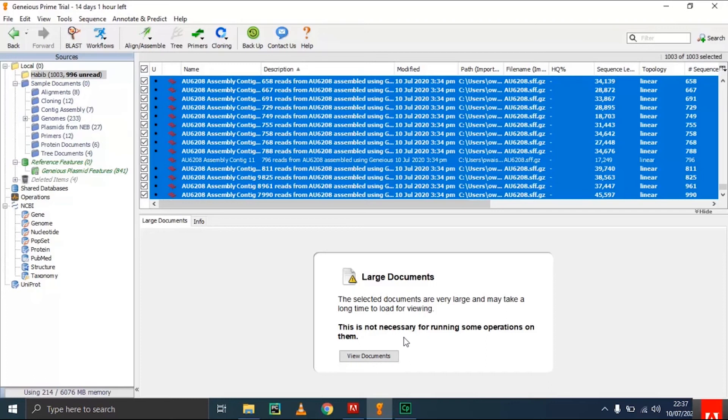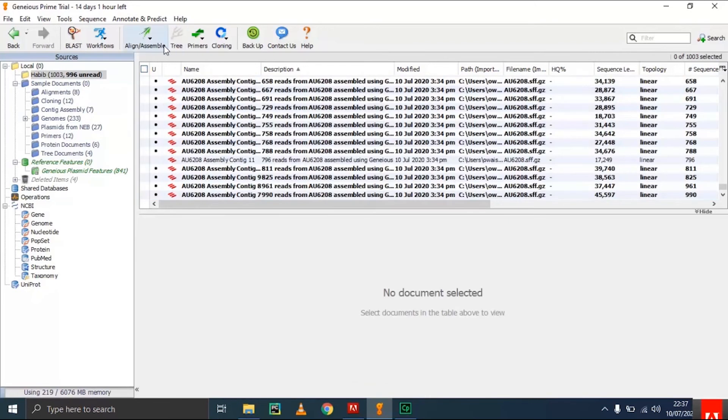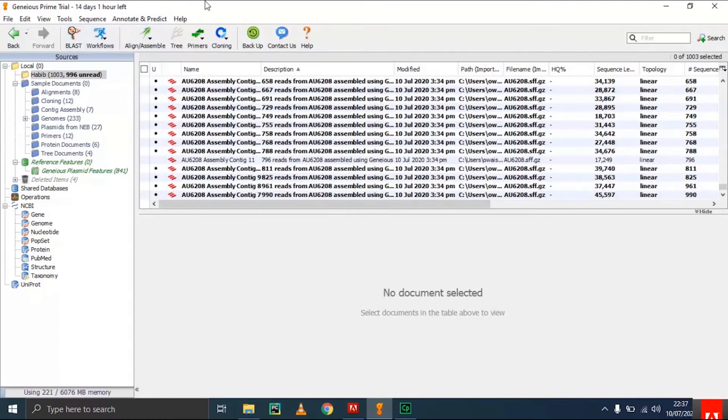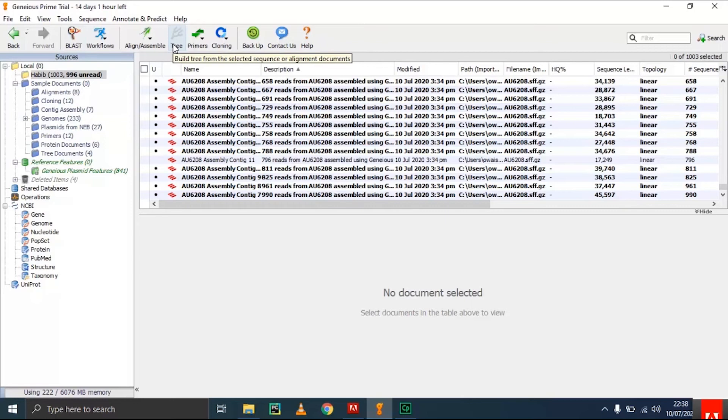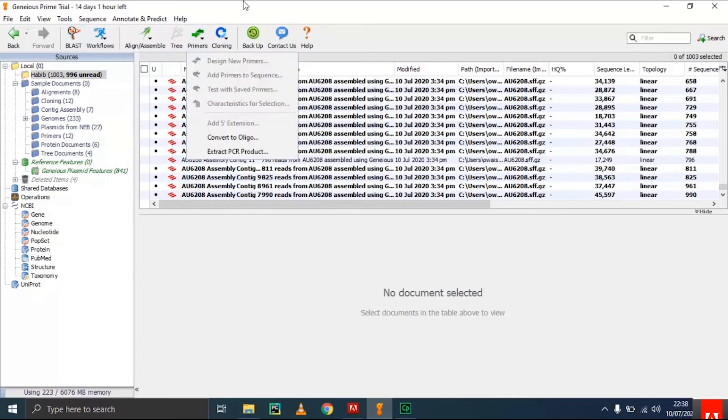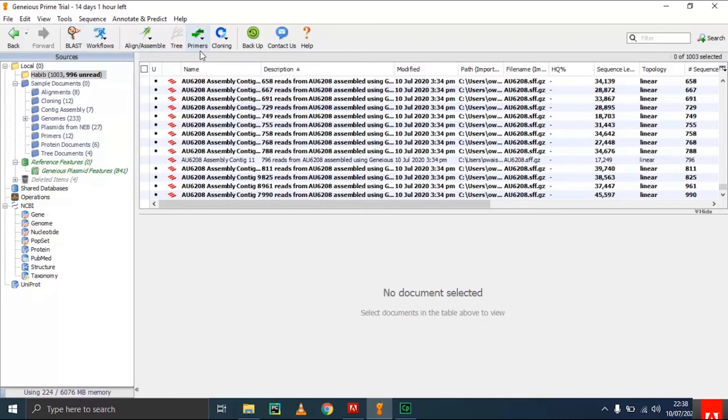There are some features: you can align the sequence, you can do BLAST, you can design a phylogenetic tree. However, you cannot design phylogenetic trees from this large dataset—there are few limitations which we will see in future upcoming videos. You can design primers, do cloning, and use different features.